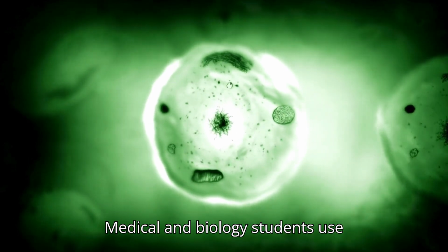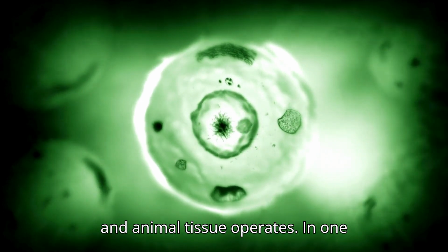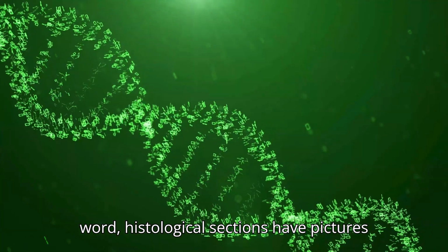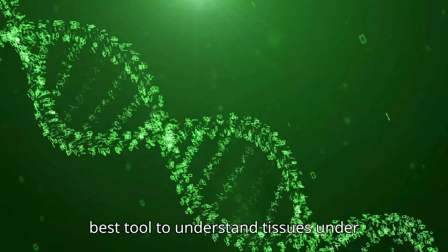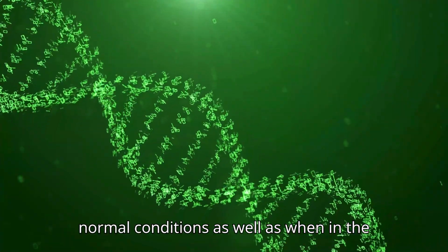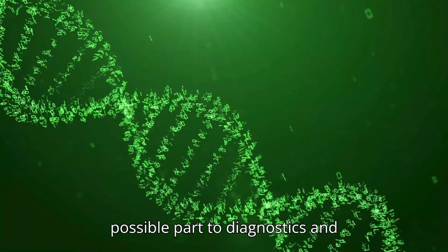3. Education: medical and biology students use histological slides to learn how human and animal tissue operates. In one word, histological sections have pictures of microanatomy in detail and become the best tool to understand tissues under normal conditions as well as when in the diseased state, contributing the greatest possible part to diagnostics and research.